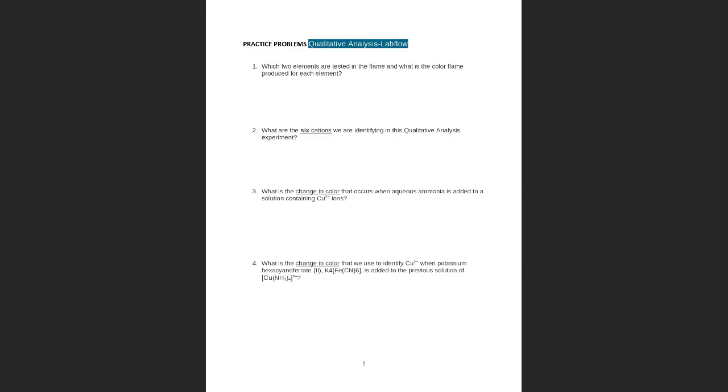Okay. So what would be the answer for that? The first answer would be, when we were testing with the flame, and when sodium was there, it turned into a yellow flame. Very good.